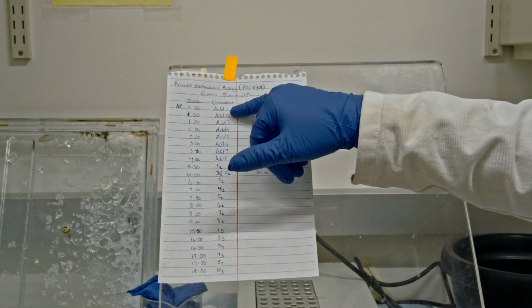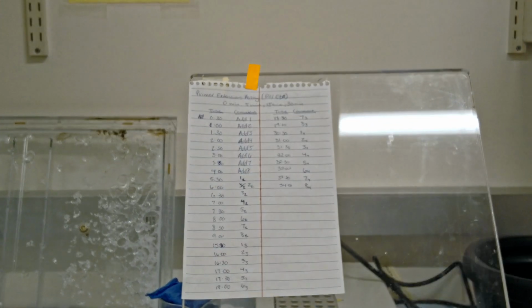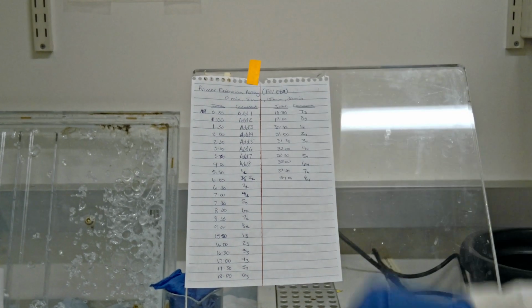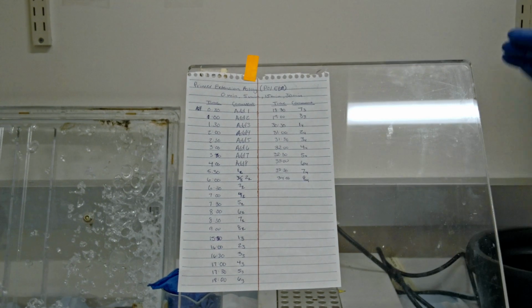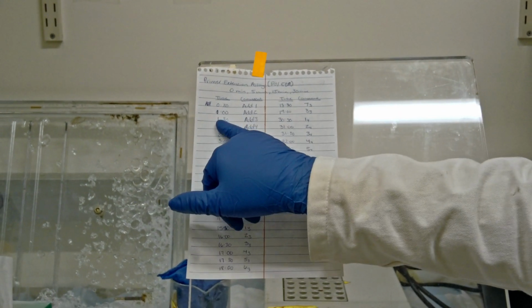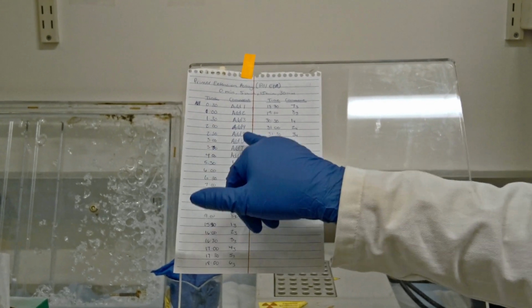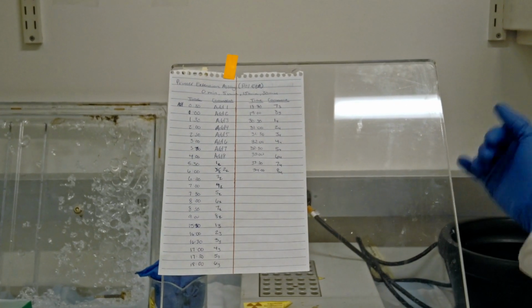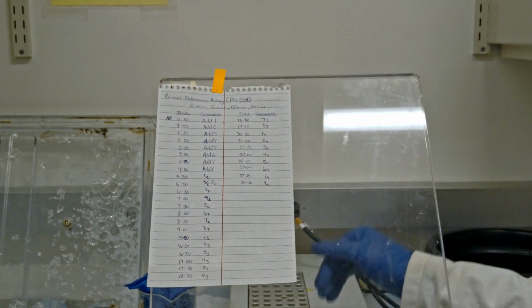Here where it says comment and here where it says time, at time 30 seconds, I add to 1. What I mean there is that I'm going to add my mixture of dNTPs into reaction vessel 1, and then once I do that, I put it on the heat block. And then at minute 1, I do the same for 2. At minute 1:30, I do the same for 3. At 2 minutes, I do that for 4, and so on and so forth, up until I get to minute 4, which is the addition of my last set of dNTPs into reaction vessel 8 and put it on the heat block.